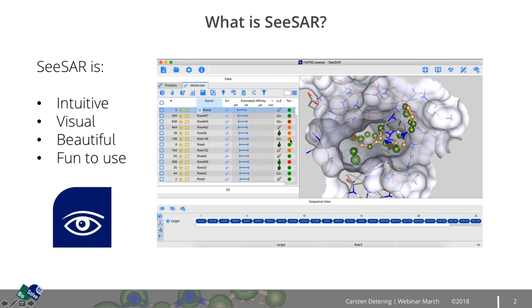Then the torsional quality of the ligand — we will take a closer look at that later in one of the use cases. You can see how well the overall conformation works in the binding situation. And then the most important thing is the estimated affinity: in which region of the scale is the ligand situated that you're currently working on. This whole interface is very beautiful, and the most important thing is that it should be fun to use. If you have fun using software, you will get more productive right from the get go.